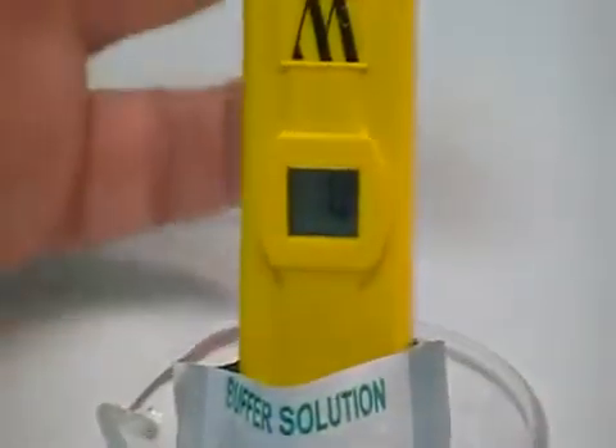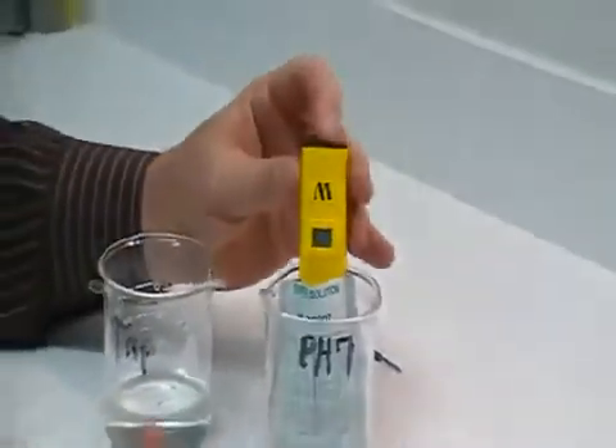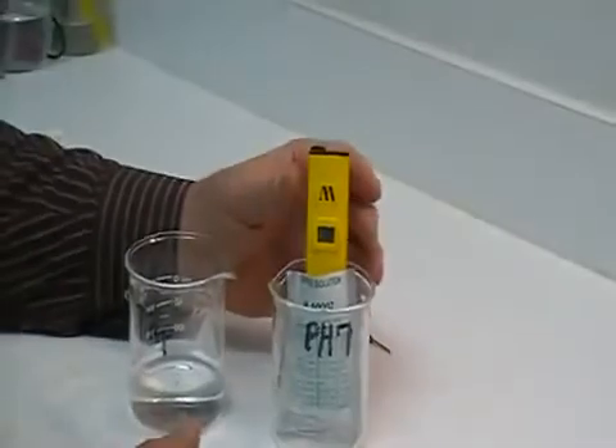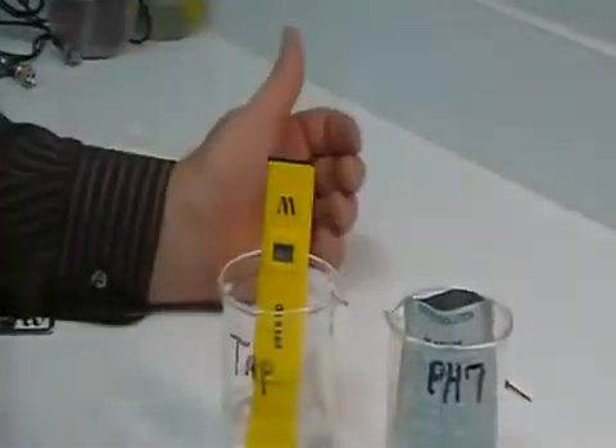At this point, you're calibrated. You can turn the unit off, or you can turn the unit back on and proceed to do whatever testing that you want to test.